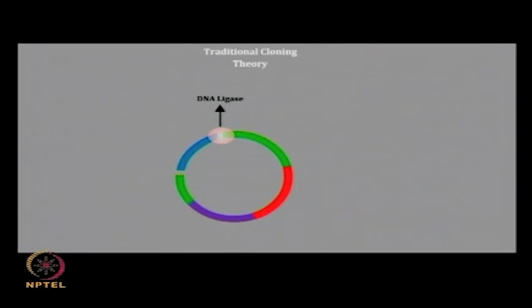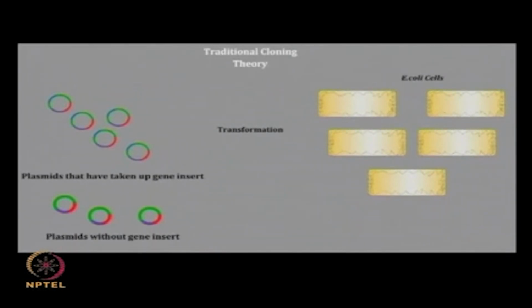The complementary sequence overhangs that are produced in the plasmid and gene insert during restriction digestion are useful for proper orientation of these fragments during the insertion. The insert is ligated by means of DNA ligase enzymes. The insertion of fragments within an antibiotic resistance gene leads to the inactivation of this gene. After this, the transformation process occurs.